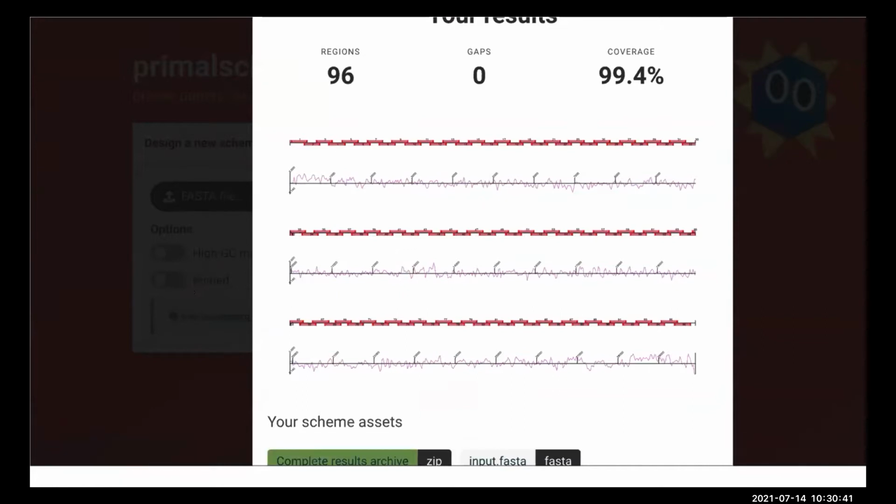And the reason that you have to do two reactions is because you can't put them together, because of that overlap, you would form an overlap product between the right and the left. So you need to have them in two separate reactions.